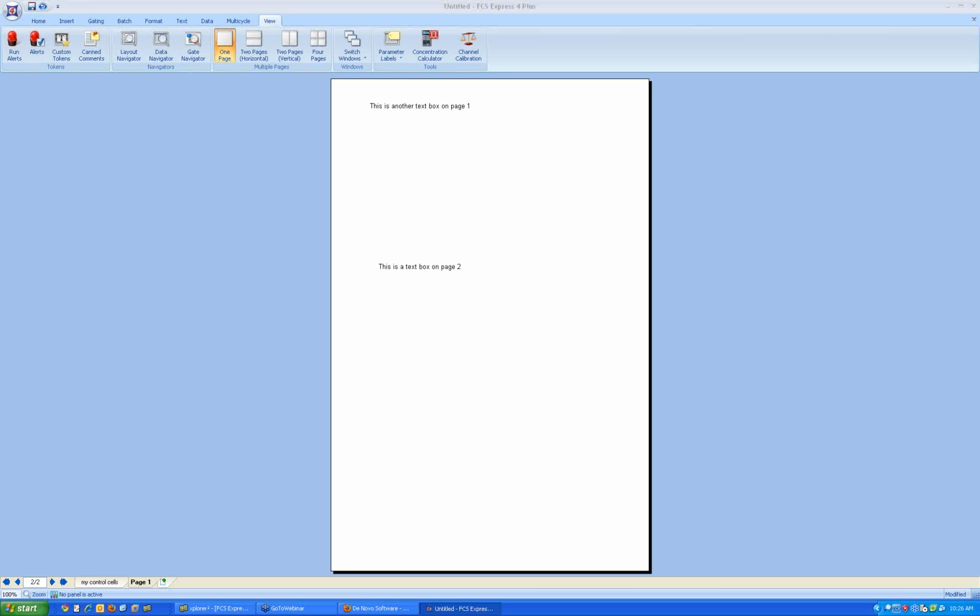Everything in version 4 is backwards compatible with version 3 and will work with any layout that you created in version 3. So moving pages around, dragging and dropping plots, if you load the layout from version 3, it will load in version 4 and you can do everything.